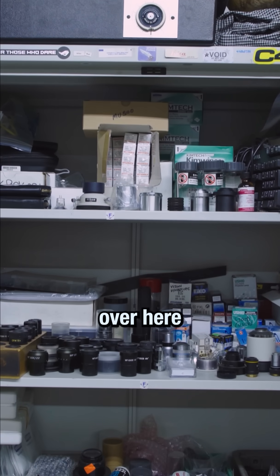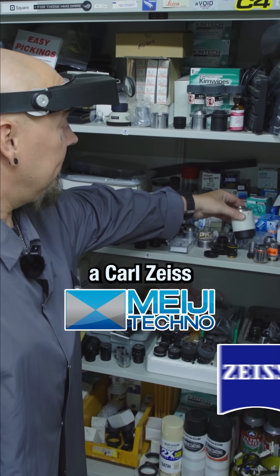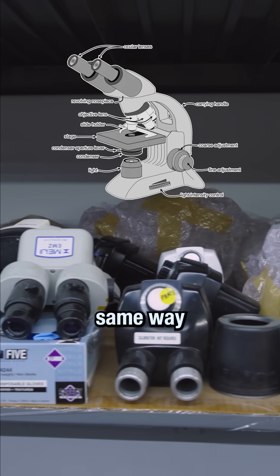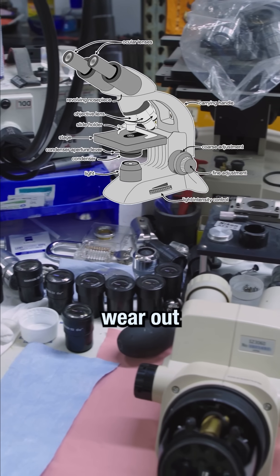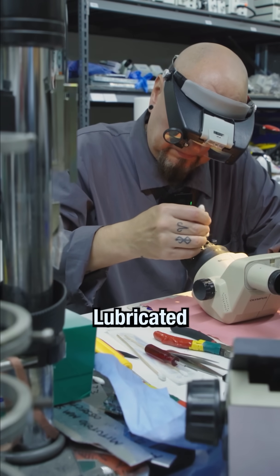All my parts are in this cabinet over here. These fit into them easy, you can tell just by looking at them. This goes onto a Carl Zeiss. If it's a stereo zoom microscope, they're all pretty much made the same way. The same parts wear out, the same gears wear out, the same glass needs to be re-cleaned and parts need to be replaced, lubricated, whatever.